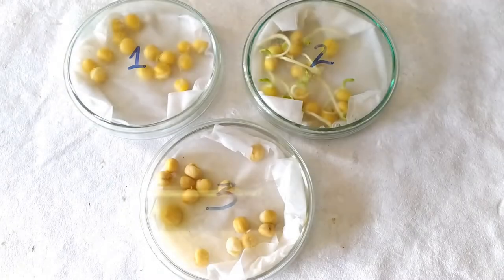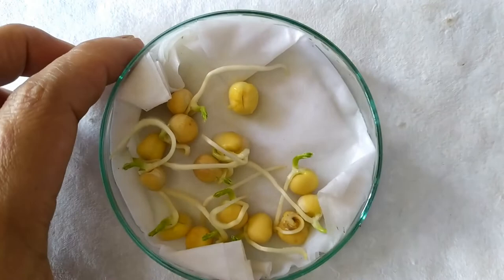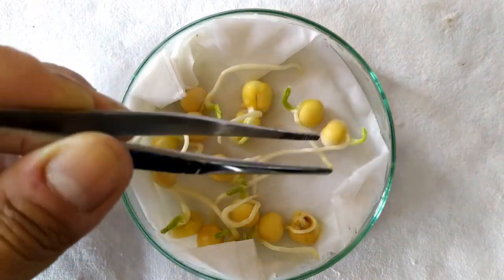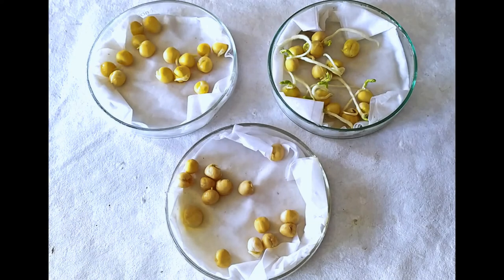You'll find that the temperature extremes do not favor germination, as plates 1 and 3 show little or no signs of germination. In plate 2, however, the seeds being exposed to a favorable temperature began germination. This is evident from the appearance of young shoots and roots in the seeds in plate 2. This simple experiment demonstrates the importance of a favorable temperature range for successful germination to take place.